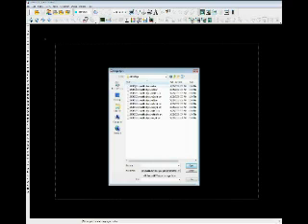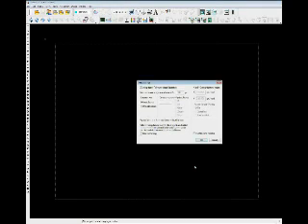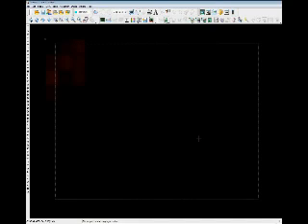We'll select the cell montage because that's where my stacks are. I'm holding the Shift key so that I select all of those image stacks. I'm going to select Open. It'll ask me to confirm the scaling. And then all of the image stacks will be loaded.